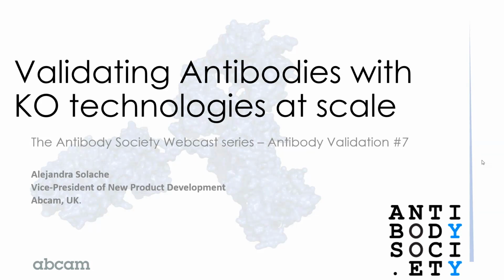With the new knockout technologies becoming widely spread, it is really one of the best technologies. For example, compared to knockdown, which is a lot more unreliable, and compared to other more complex applications such as mass spec that not everybody has access to.